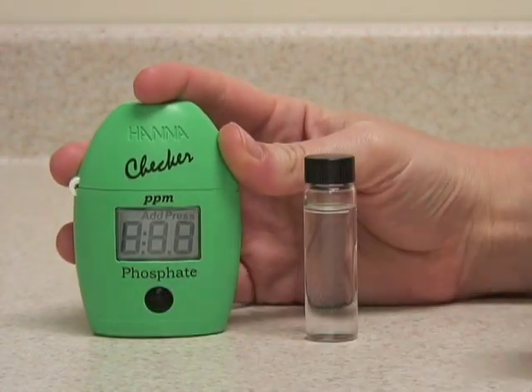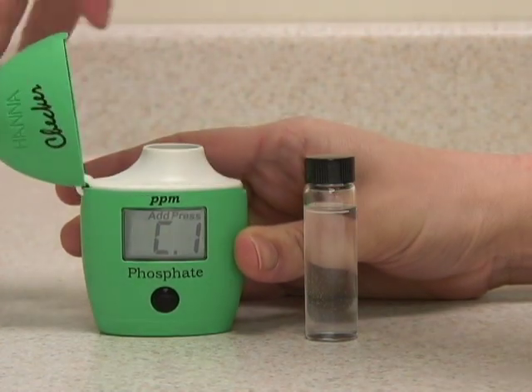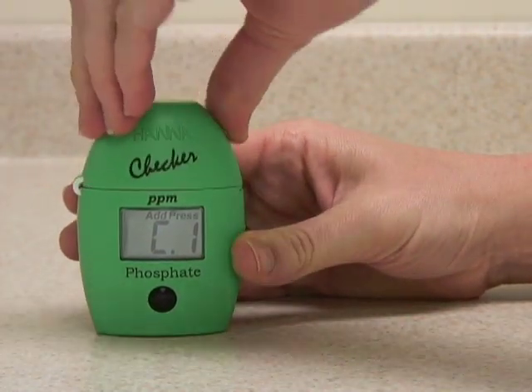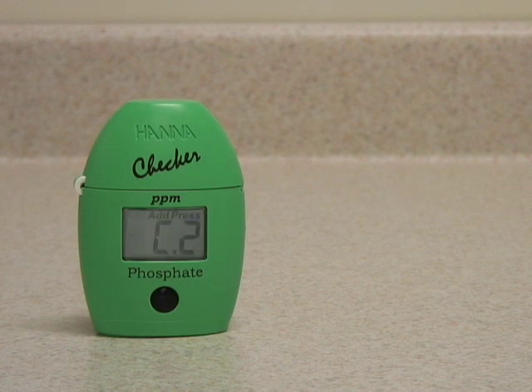Push the button once to turn it on. When it displays C1, use a blank sample to zero the instrument. Insert the vial into the meter and press the button again. It will flash bars to let you know it's sampling.